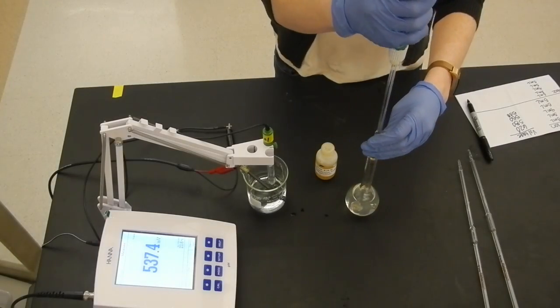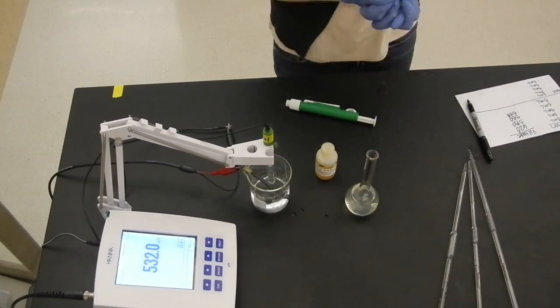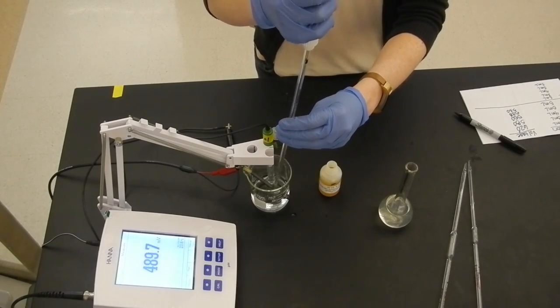In part 2, we will test if the potential of an electrochemical cell can be predicted based on the potential of the two half reactions relative to a common reference reaction.